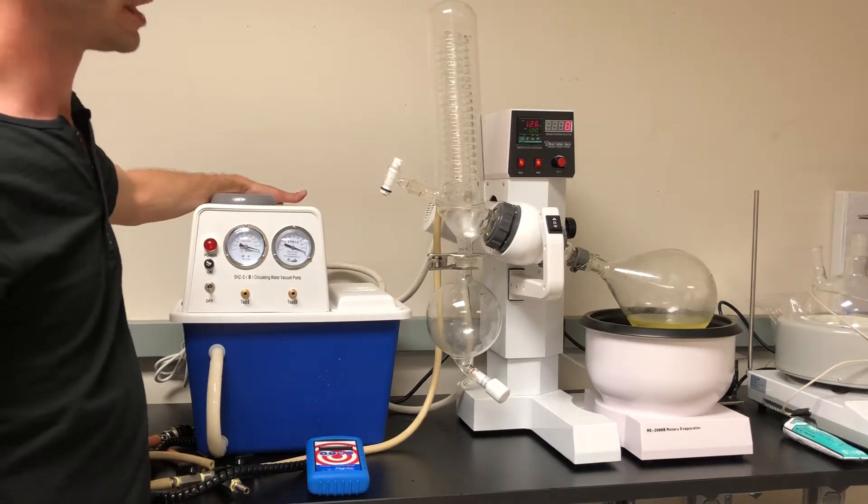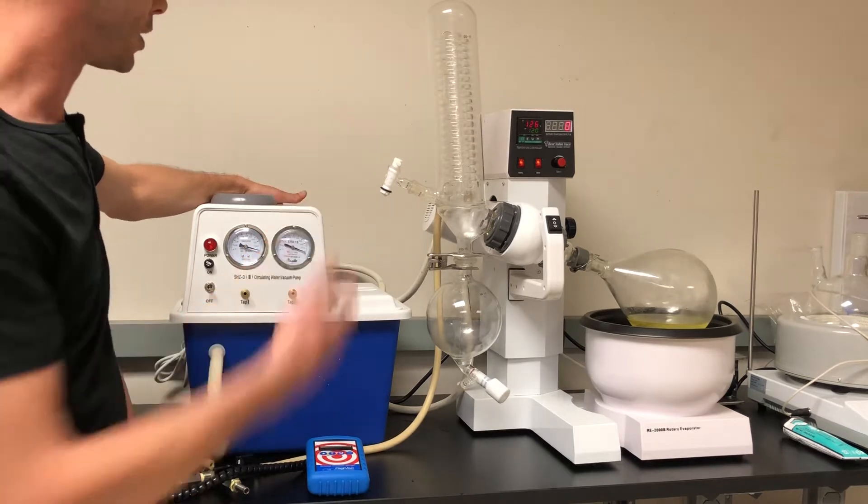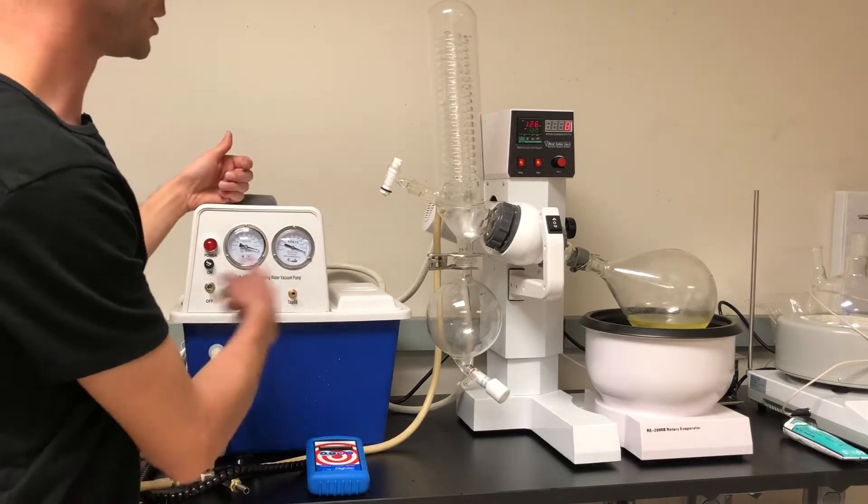There's a valve on the back, open and closed. Basically you can start and stop the flow of the chilling. Basically it reflows it inside here.